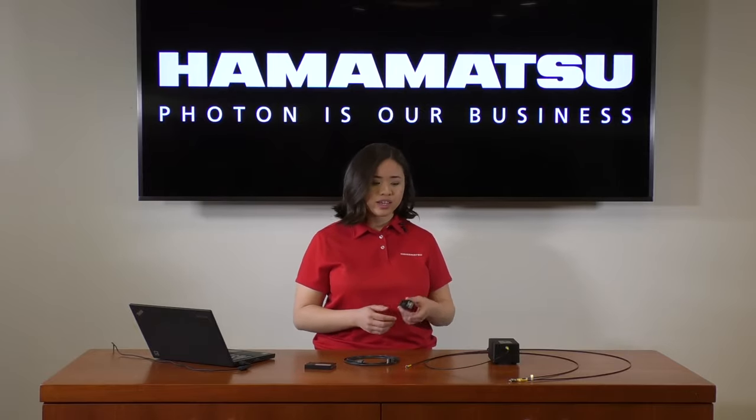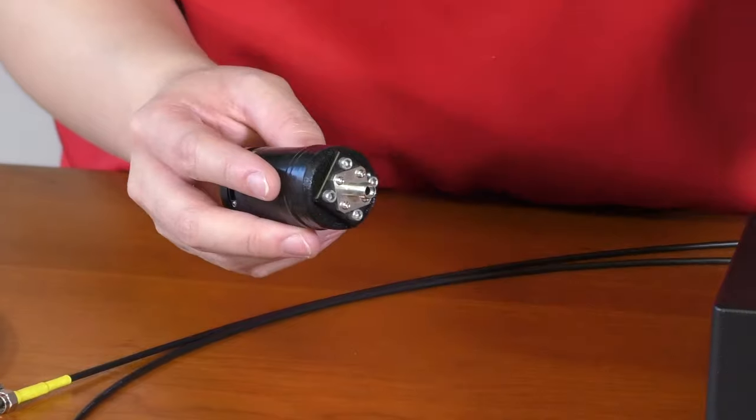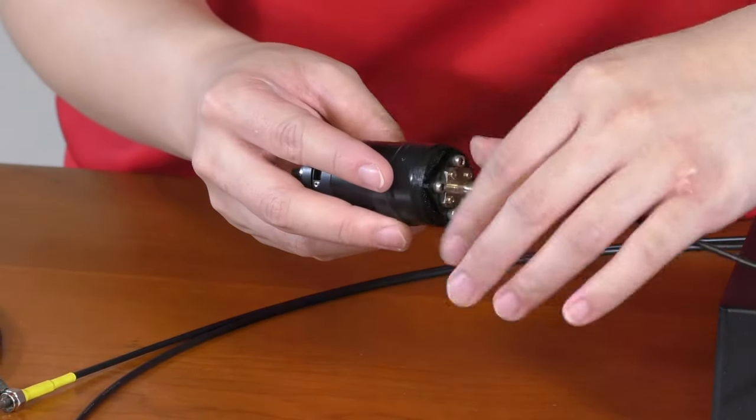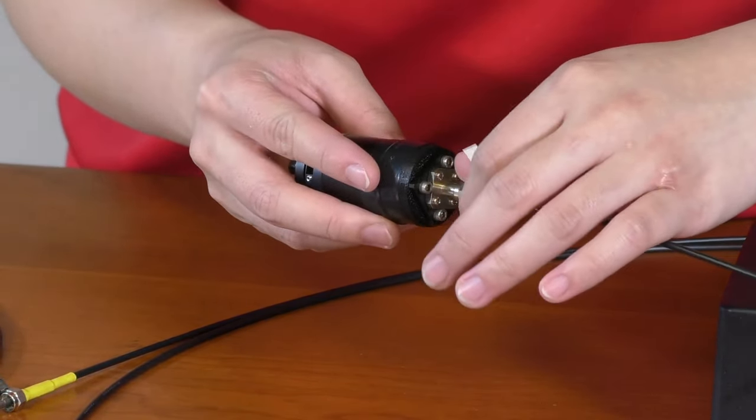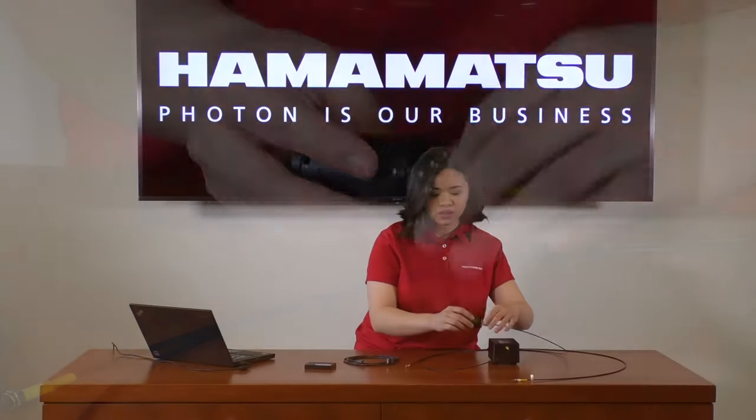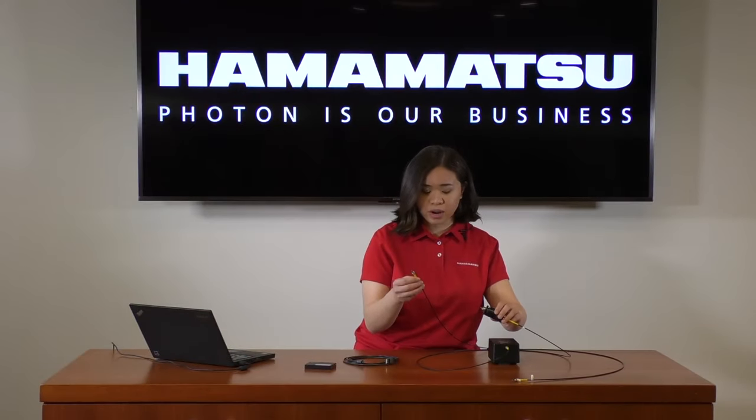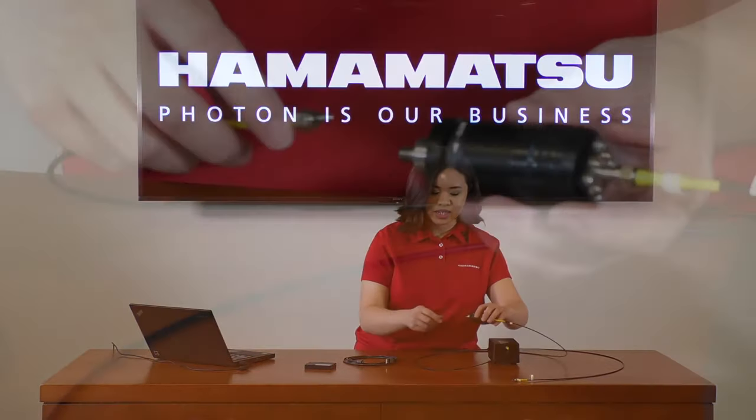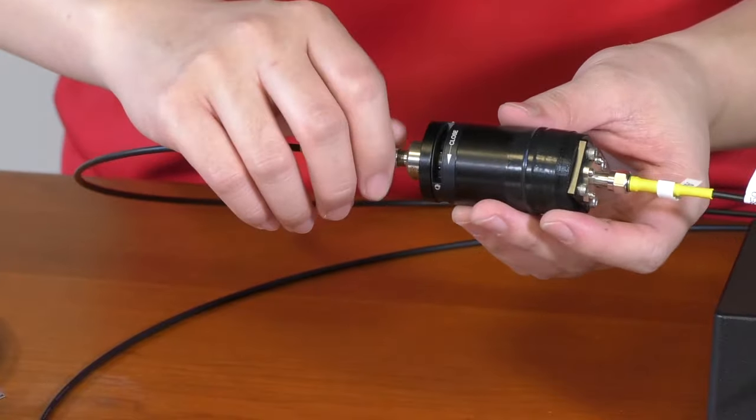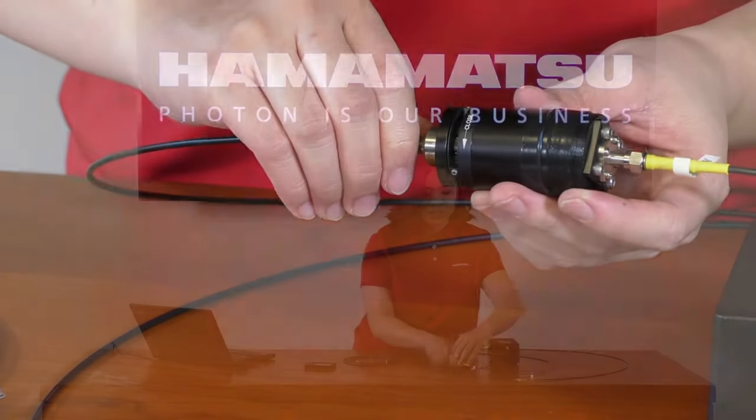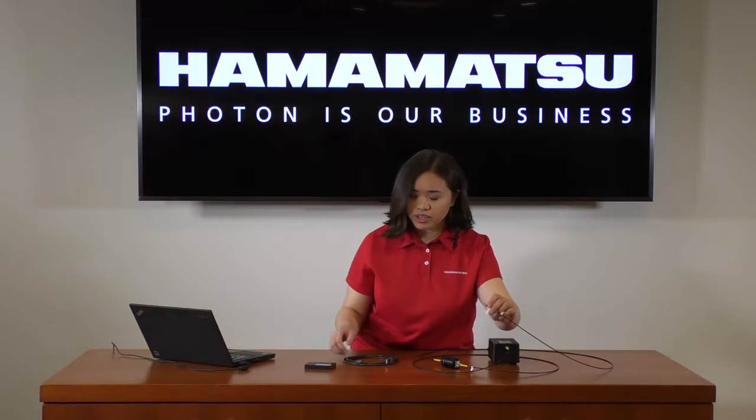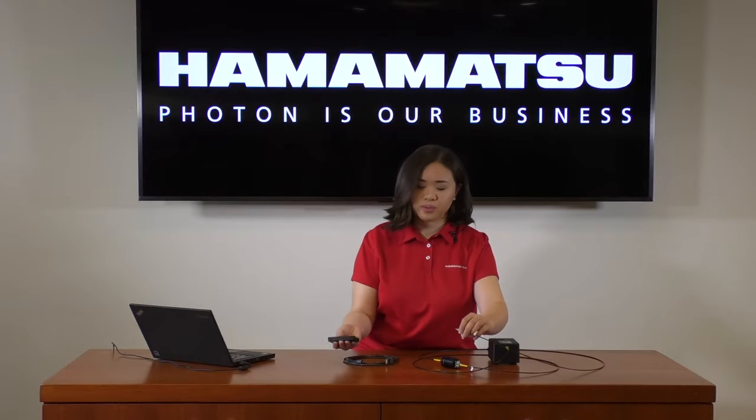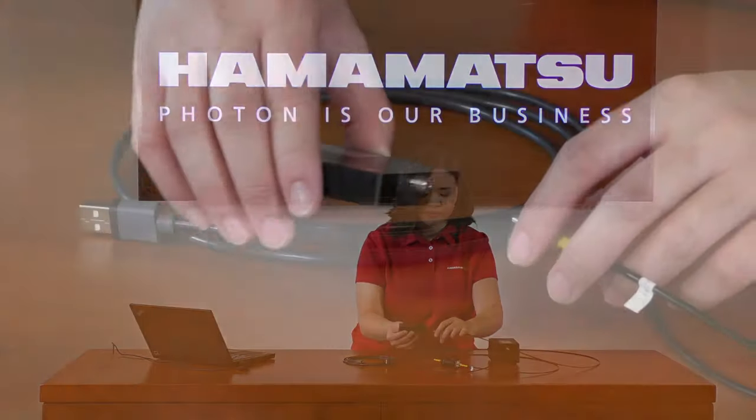So, taking the other end of the first fiber optic cable, we'll connect this to our iris. Taking our second fiber optic cable, we'll connect this to our iris as well. And then, taking the final end of our second fiber optic cable, we'll connect this to our spectrometer.